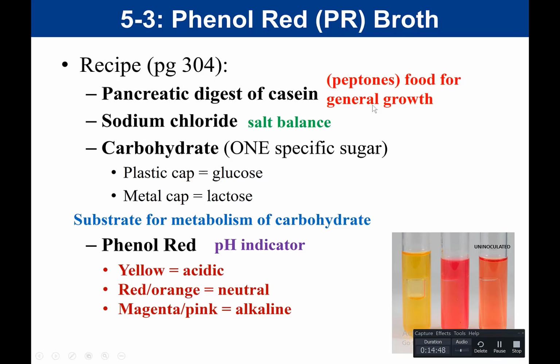Basically, it's providing these chemicals, these nutrients, like a source of nitrogen, for example, that bacteria would need to grow. And as a result, in a phenol red broth test, you should see growth to say whether it's a positive or a negative. If you get no growth, we say that that is inconclusive. And I'll come back to that in a little bit.